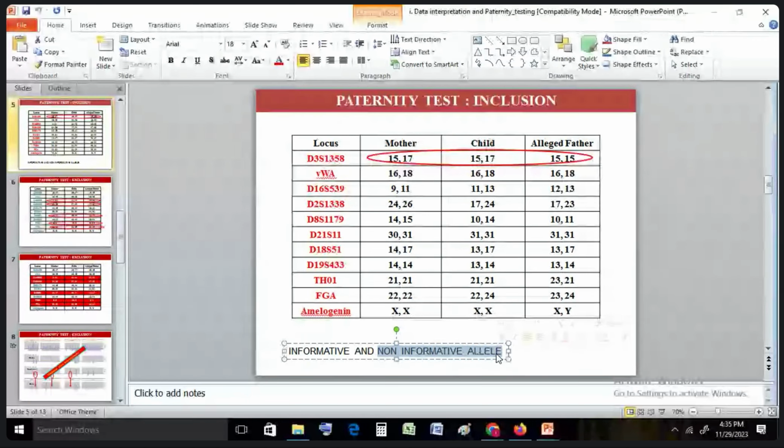This is not giving any conclusive result. Just exclude this result from your analysis. Don't call it match or mismatch. You cannot say it is match or mismatch. So just exclude it. Now move to the next locus.